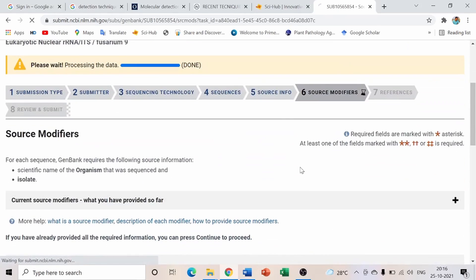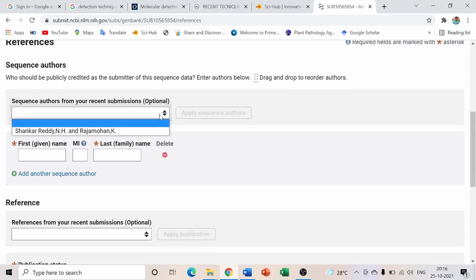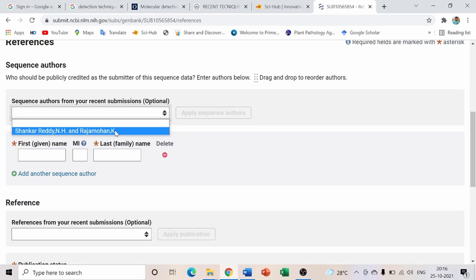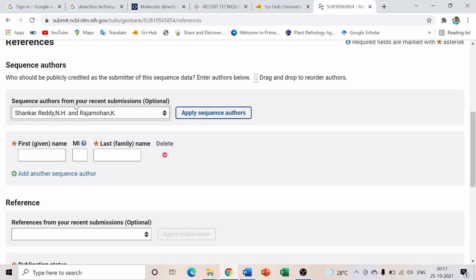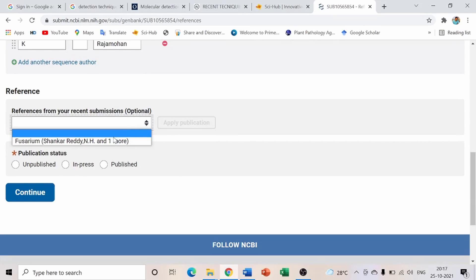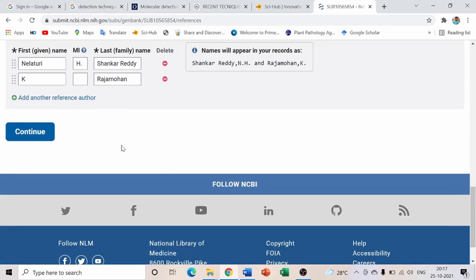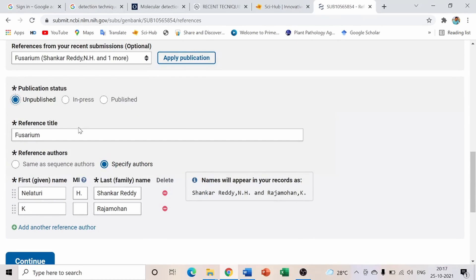I am adding two fields: host (chili) and collected by (my name). Click Continue. The next step is Source Modifier, and after that, References. I already added my name and my supervisor's name. If you are new, add them manually with first name, middle name, and last name.